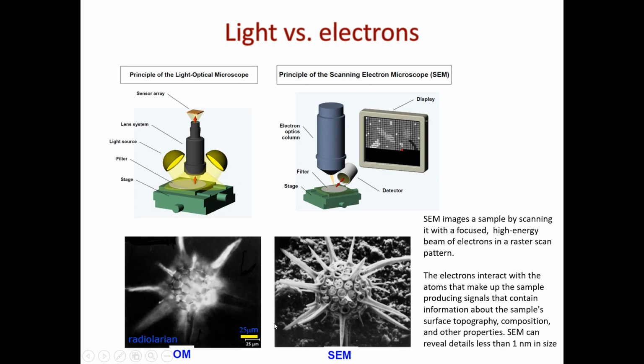Okay, so this is radiolaria. They're critters that have very elaborate shells. They're a fraction of a millimeter. You can see details of those shells because electrons are actually probing inside and coming out. But if you look deeper, you will see a different scatter than from those that scattered off the shell surfaces. And this is what we use in polished sections of the porous media as well. We're going to get to that. So SEM is used quite a bit.